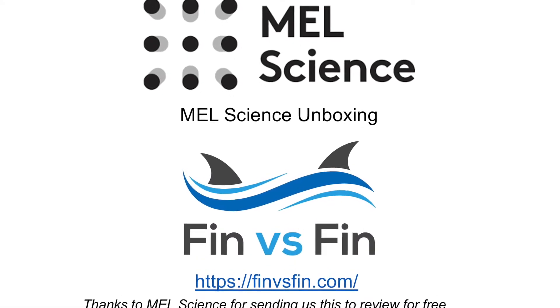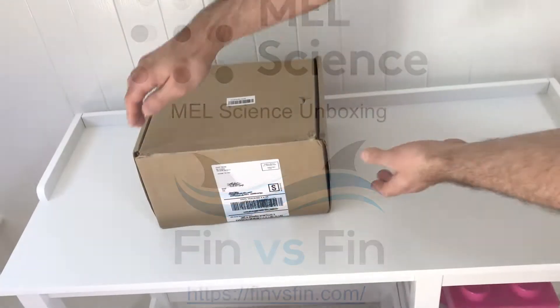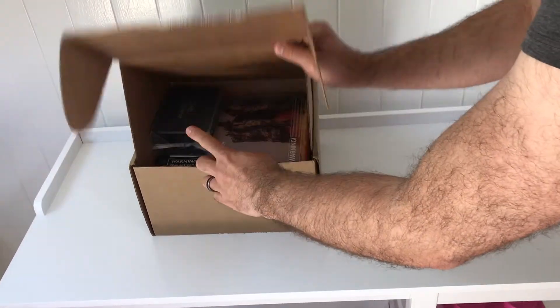Let's unbox a MEL Science kit. Thanks to MEL Science for sending us this kit for free for us to review it. Here's the starter kit in the box that we got in the mail. We're going to pop it open and show you what's inside.